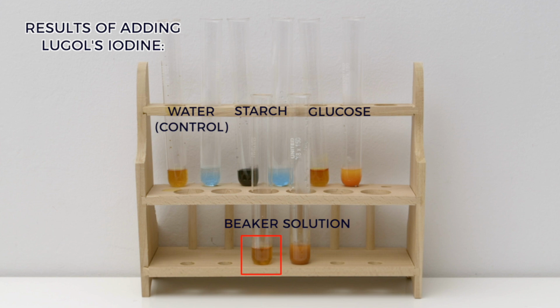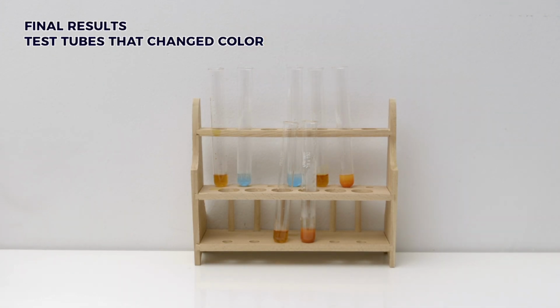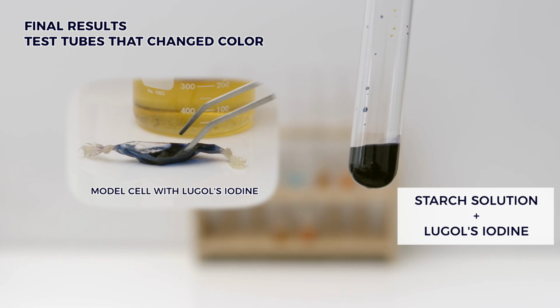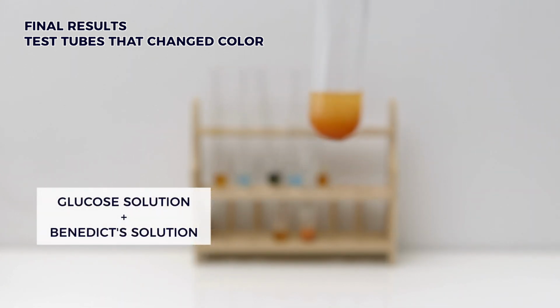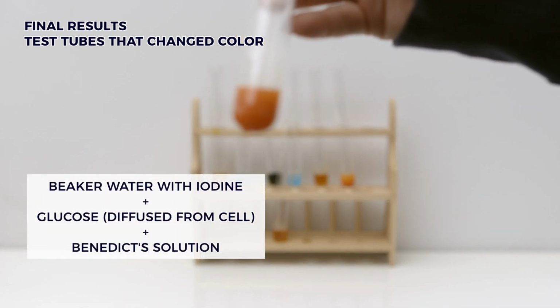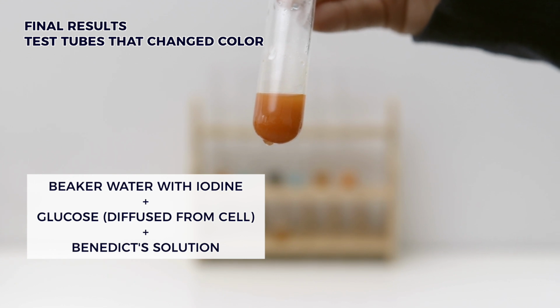Let's take a closer look at the individual test tubes that had a color change. The first one had starch in it since it turned blue-black, the same color as the inside of the model cell. The second test tube is a bright orange that had the glucose solution. The last test tube is a dark orange because it already had the amber iodine solution.